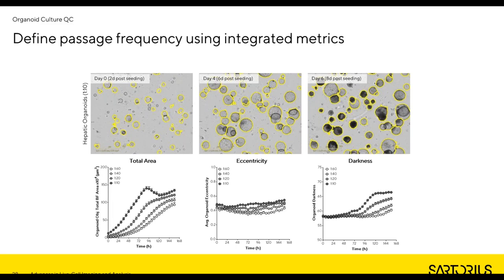And again, that lines up quite nicely with what I described in the images, where at day 4, we can see that these reached maximal size. And when we look at the time course of the 1 in 10 of the total area, we can see at 96 hours they begin to plateau, and you see this slight decline in the total area.